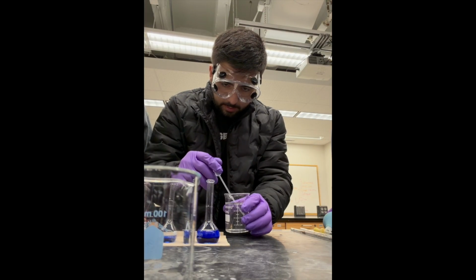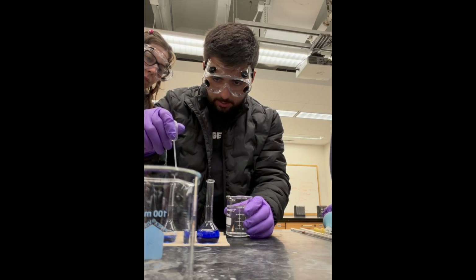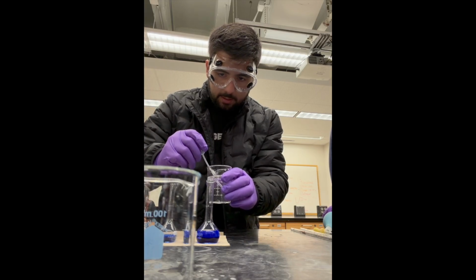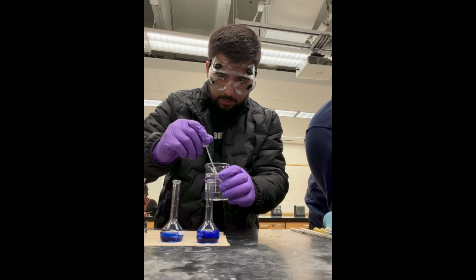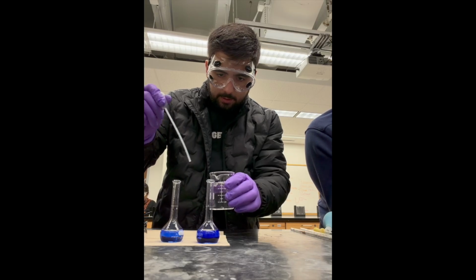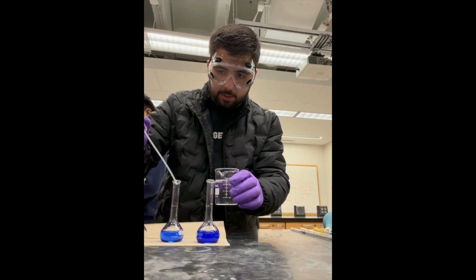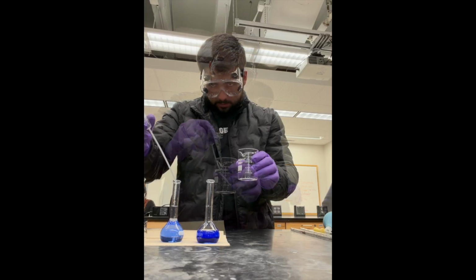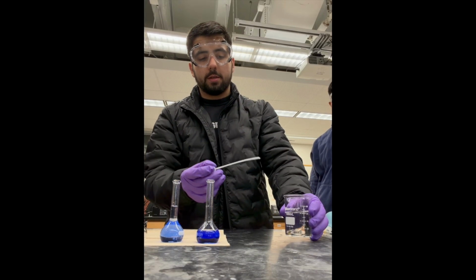In this second clip now, I've added the 5 milliliters of the stock solution, and I'm now adding 20 milliliters of water to top off the volumetric flask, so the meniscus reaches the top little white line up there. The reason we're doing this, by using the 5 milliliters of the previous dilution, or in this case the stock, is that we're able to mathematically calculate the molarity as we progress through these dilutions. In the final clip, you see that I've filled it up all the way to that line, finishing our dilution.